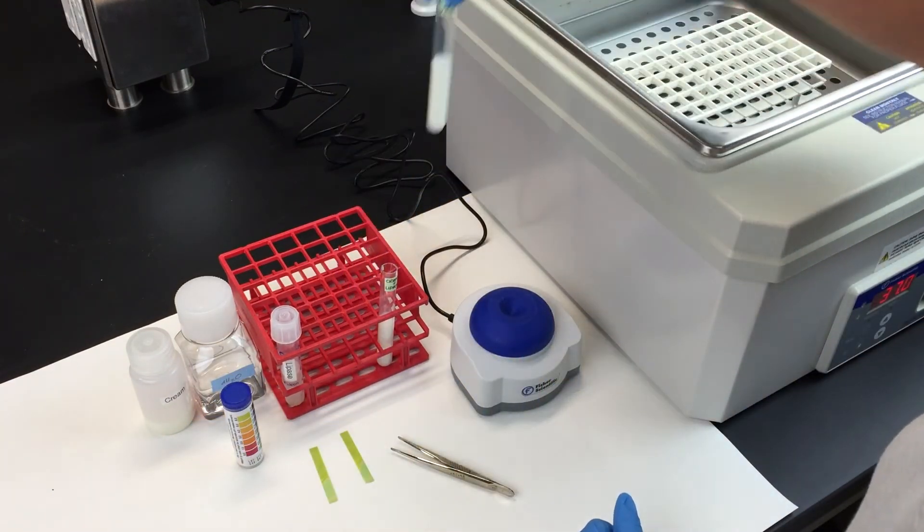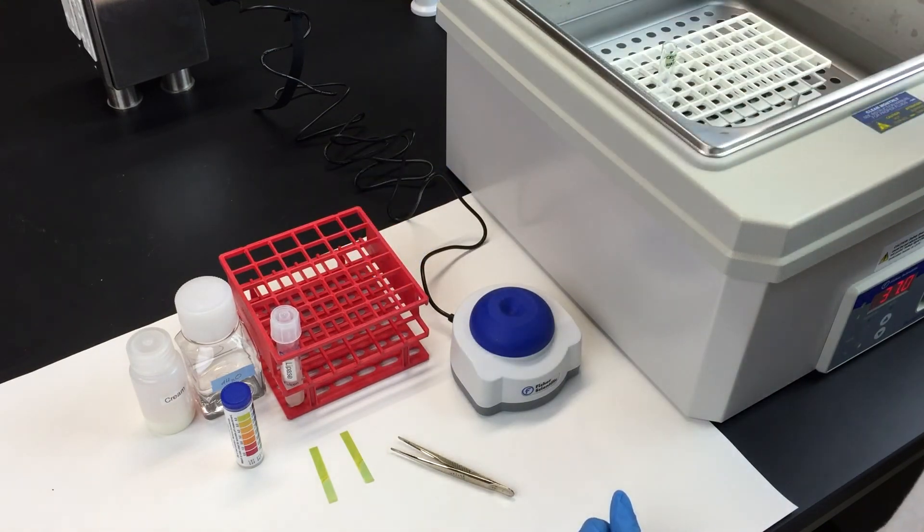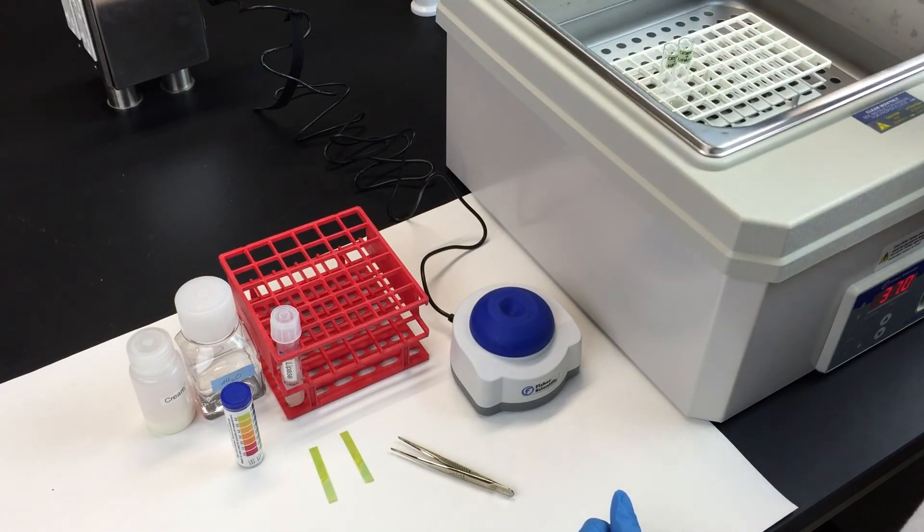Put the tubes in a 37 degree water bath for 30 minutes. After 30 minutes, remove the tubes and check the pH again and note it down.